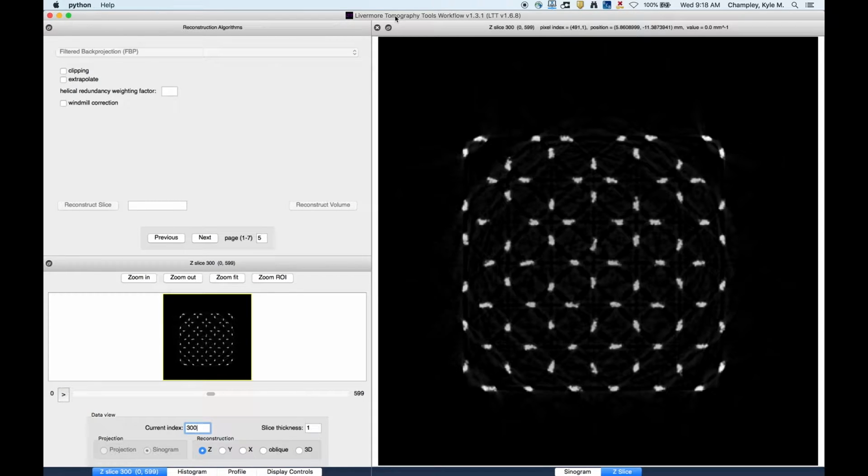In this video, I will be talking about some of the display and analysis tools that are in the GUI. Here I have already preloaded the truss example that I've shown a few times. In this particular one, this is the non-physics-based reconstruction. I chose this one because it has actual features of interest that we can try to measure. The other one was just a little bit too binary, even though it was a better reconstruction. There's more analysis you can do with this one.